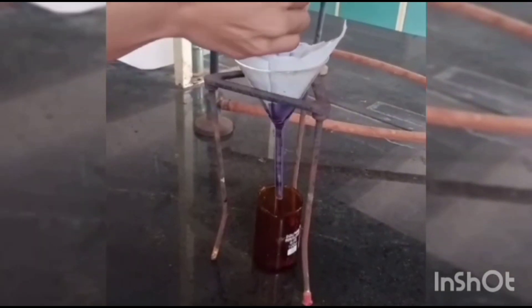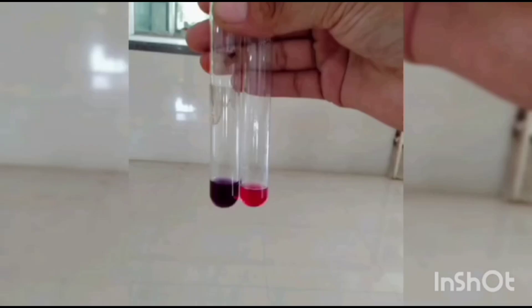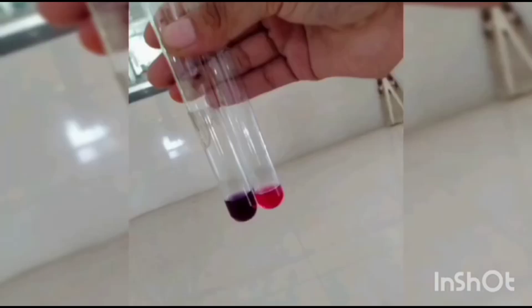Performing Zinc Hydrochloride Test: Heat the test solution with zinc dust and hydrochloric acid. A pink to red color is observed — the solution turns red, thus confirming that flavonoids are present.